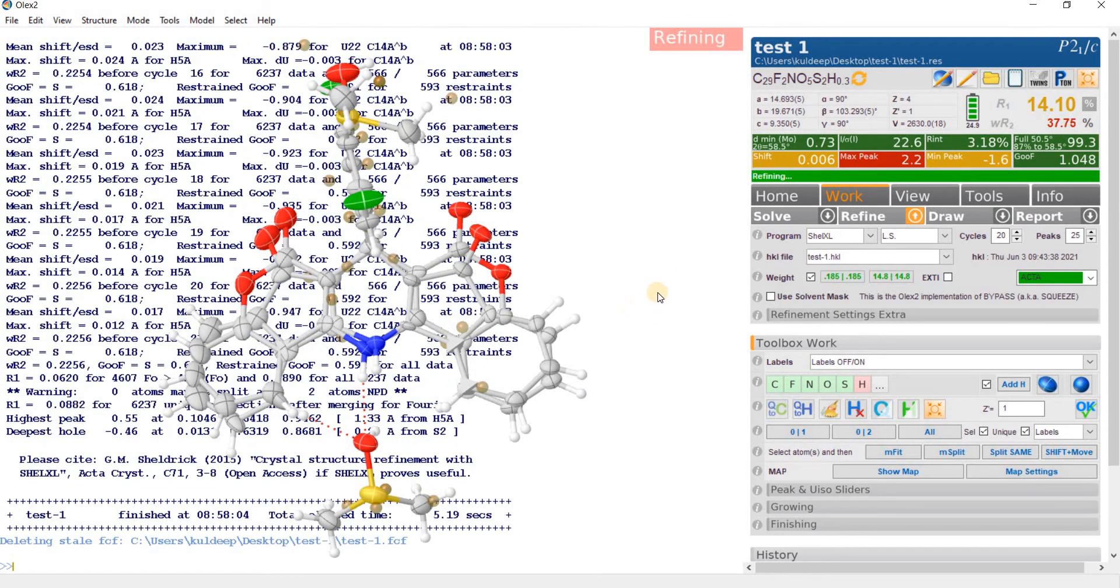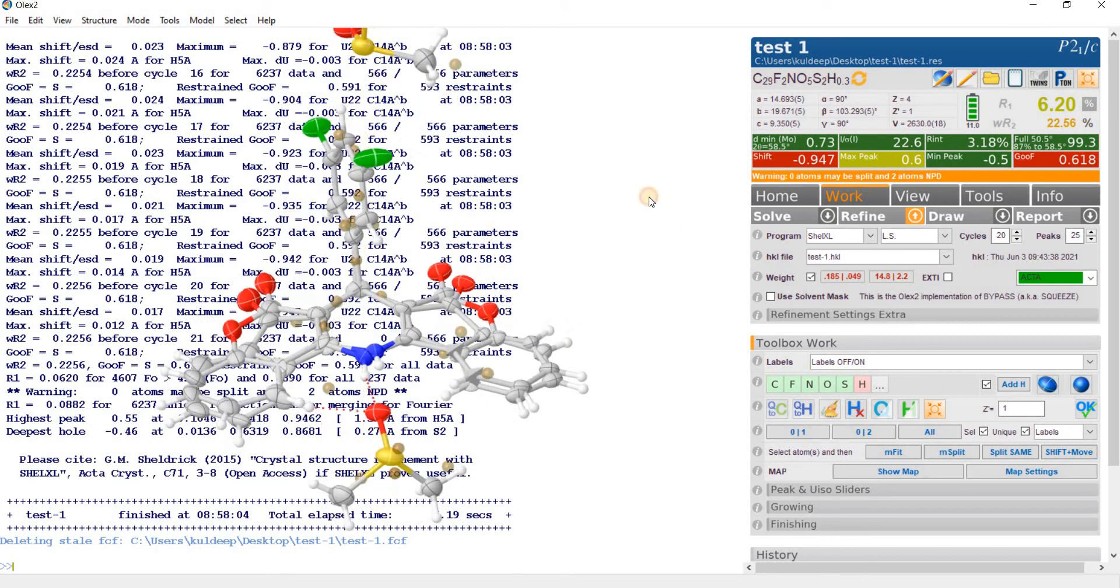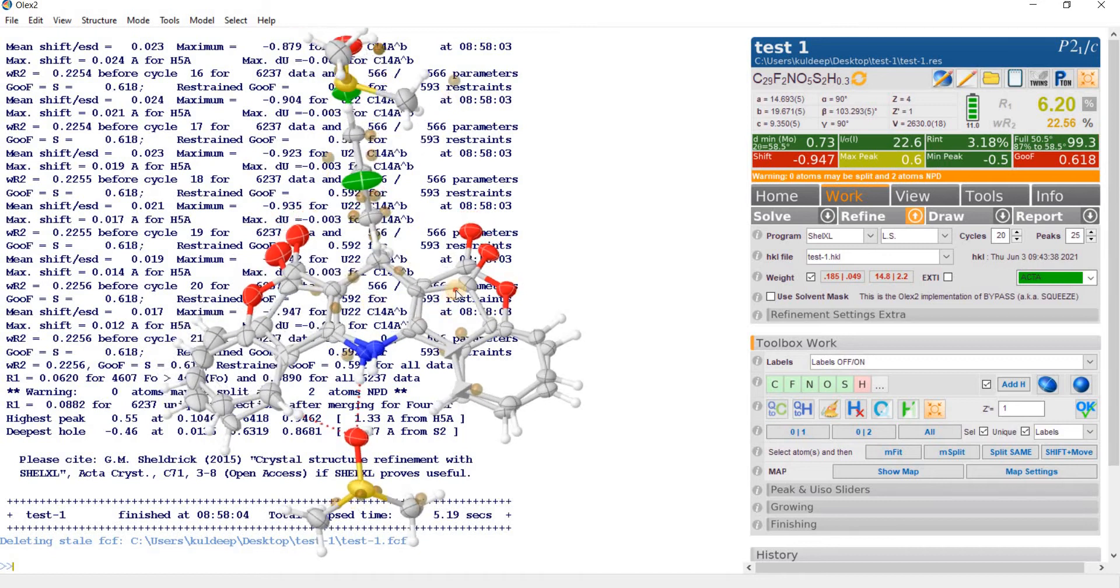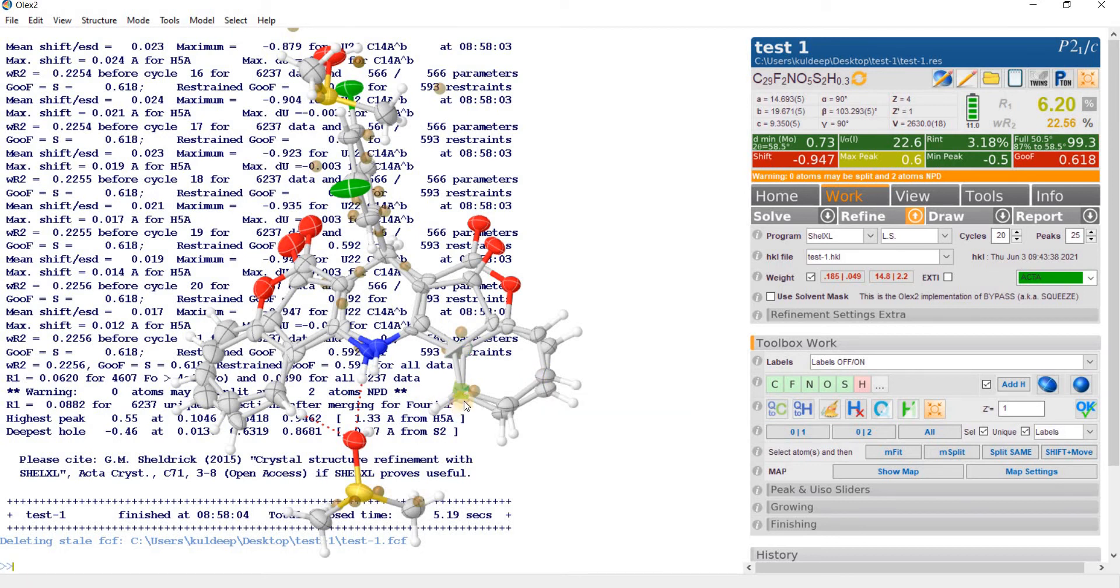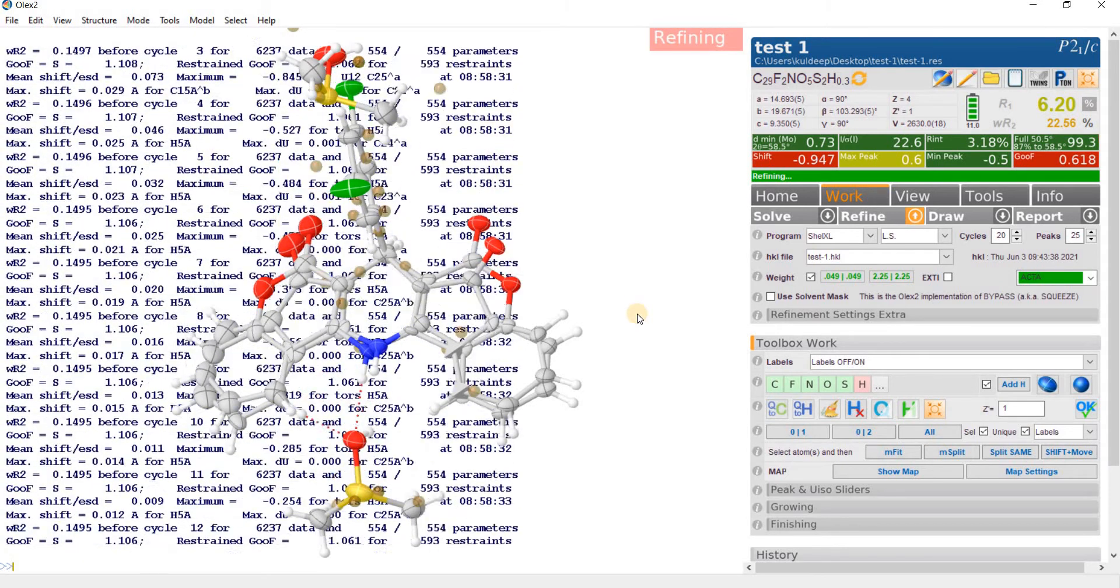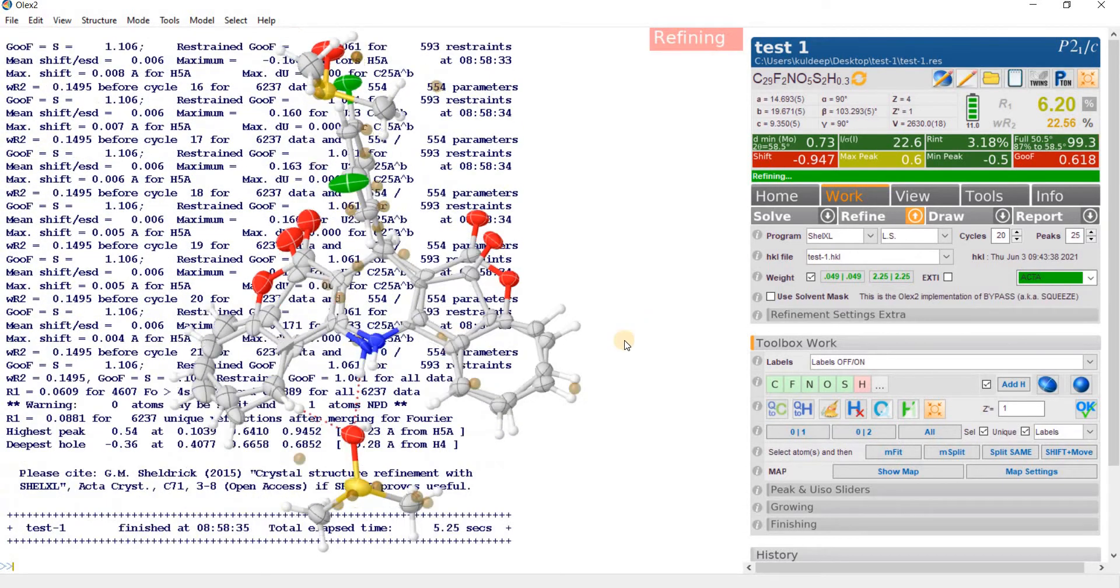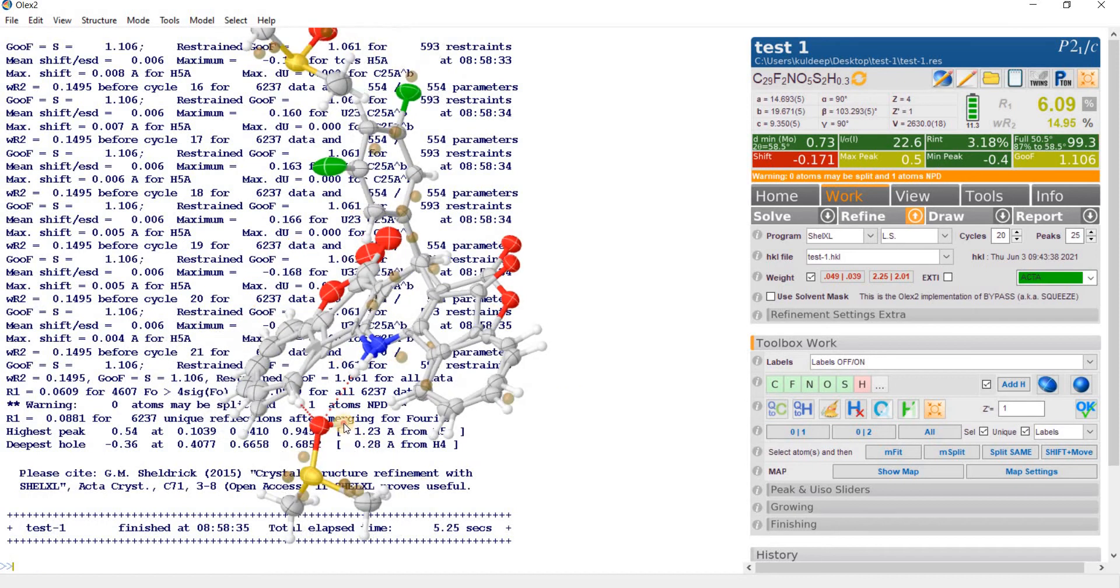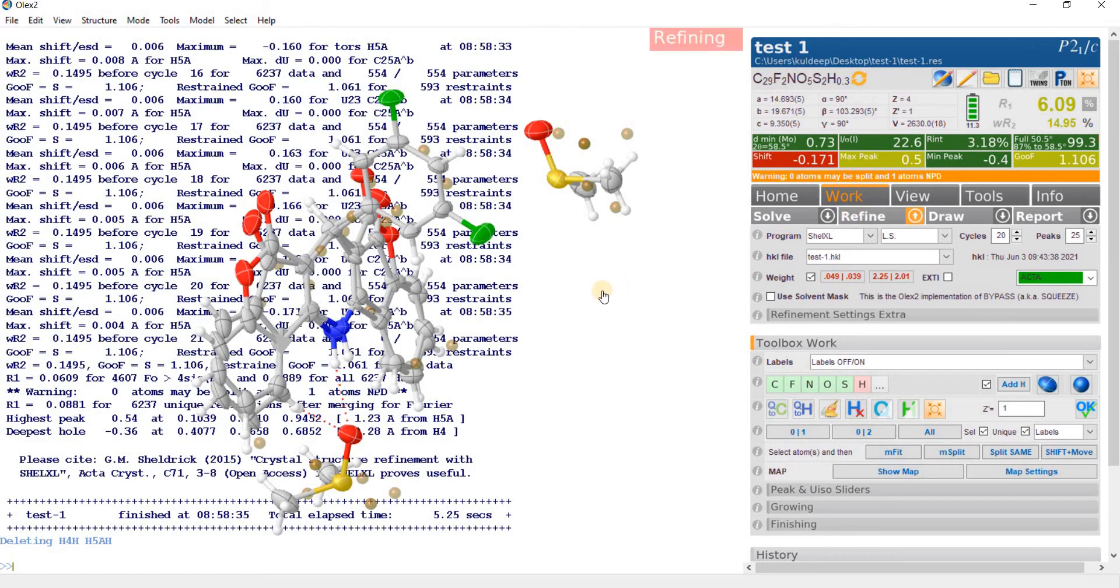Now type ANIS and RIGU and HADD and refine 20 cycle with 25 Q peaks. Now you can see the R factor is around 6.2% and some atoms are getting NPD. So just select these two atom and type EADP these two atom and refine. So now the thermals are correct. Select these two atom EADP and delete these two hydrogen atom. Hydrogens are only placed on the oxygen atom of the DMSO and refine one more time.